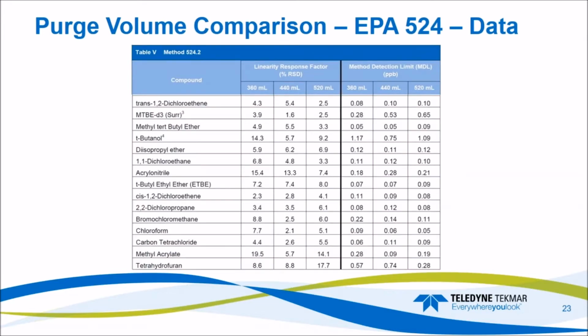And moving on to more mid-range compounds. Again, some of the compounds are pretty consistent across the board. Some for the low volume and the high volume need a little bit more desorb time. But the MDLs look great for each.